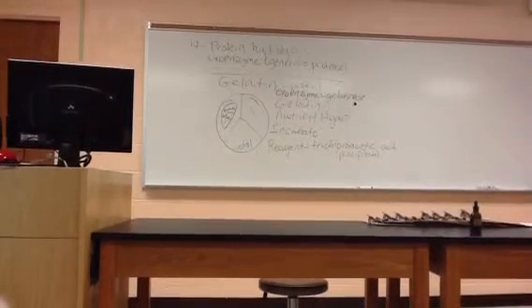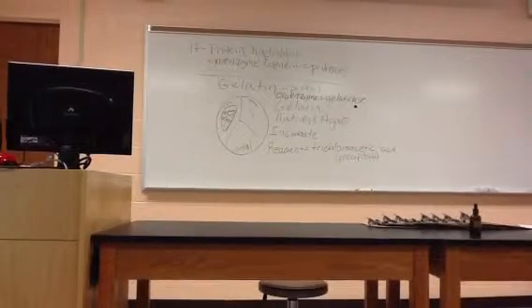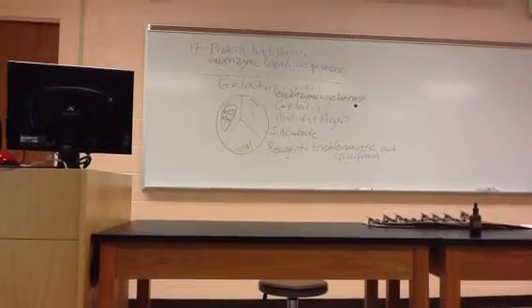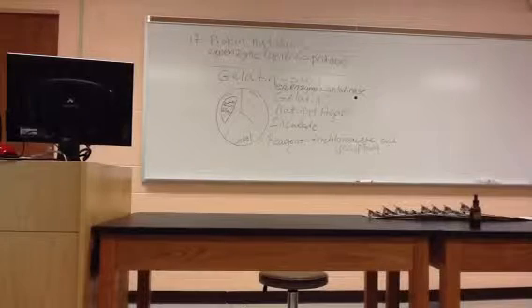Is that almost like another halo in a way? Yep. But just be careful learning it as halo because I need to know that you know what color it would have been. The halo for starch would have been black. The halo for this would have been white. So if you just say halo, I don't know that you know what it would have been if it had been negative. So yeah, it's important to note the color.